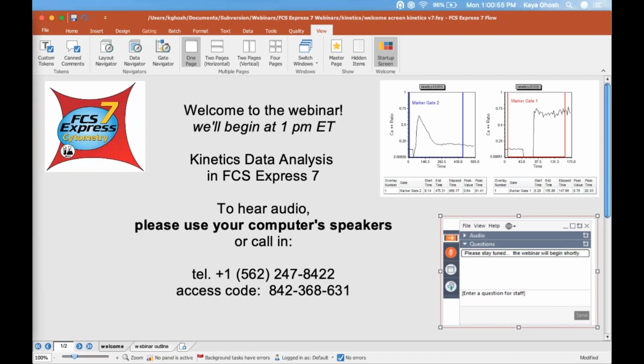I'm Kaya Ghosh. I'm a technical applications specialist with FCS Express. And today we're going to be talking about kinetics data analysis in FCS Express 7.